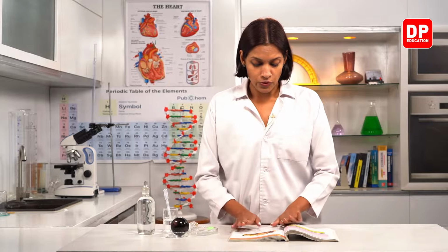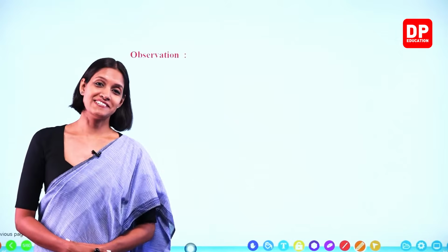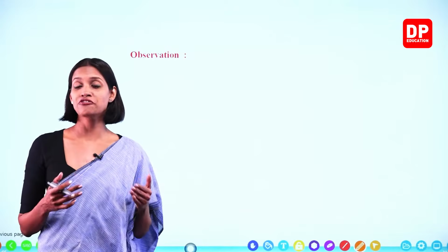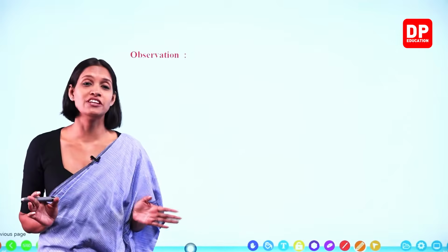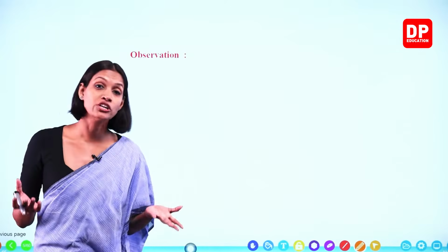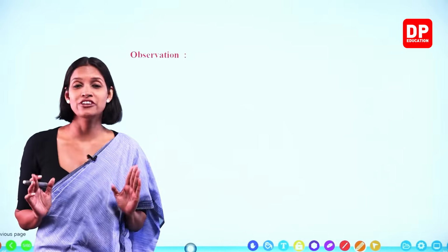Now in this case, we used a book with small letters. So here we could read the letters bigger. Right, children. So you observed what happened. Now this experiment you all can try to do at home if you can find those objects. Some of those objects you can find very easily: a polythene bag filled with water, a filament bulb filled with water, a glass bottle filled with water. Those type of objects you can find at home very easily.